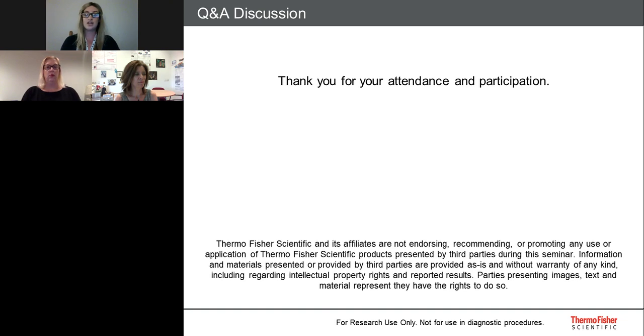So let's get started. Our first question is going to be for Dr. Deleu. How do you explain the significant improvement in QC parameters when using your in-house reference set for array data analysis?